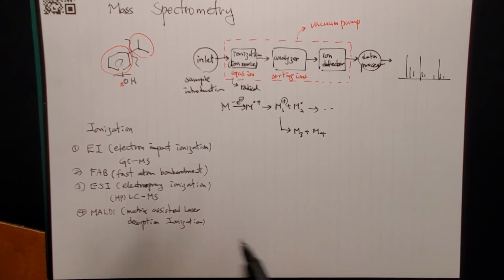Because of the nature of MALDI, the analyzer that comes with it is usually TOF, T-O-F, time of flight. So we'll talk about this now.